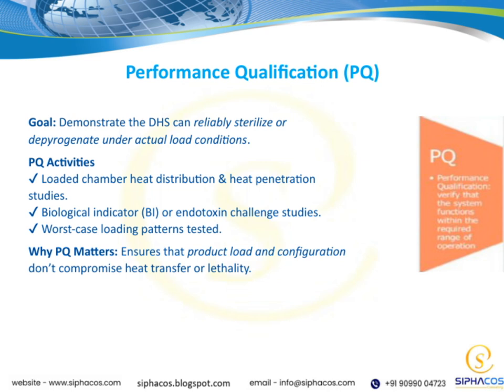Now, why does PQ matter so much? It's because it ensures that the way we load and configure products won't compromise the heat transfer or the sterilization lethality. This step is crucial for maintaining product safety and efficacy. It ties back to our overall goal, guaranteeing that our sterilization process is both reliable and consistent, protecting patient safety and meeting regulatory standards.